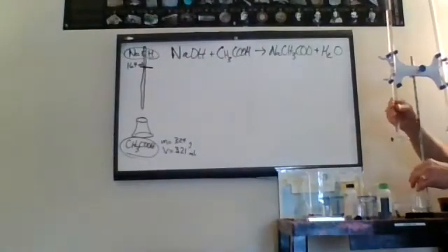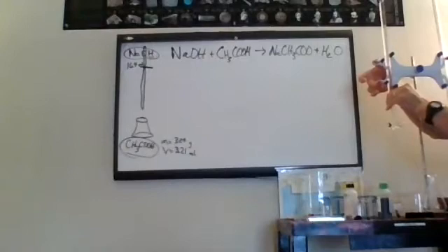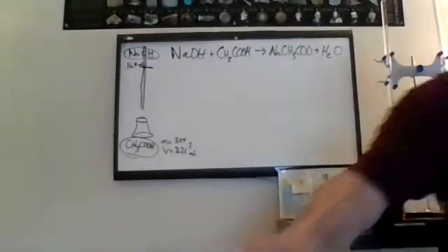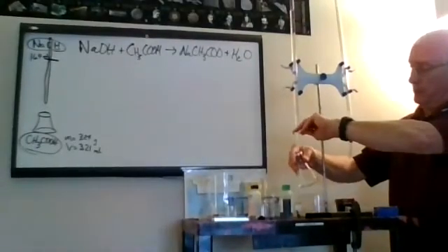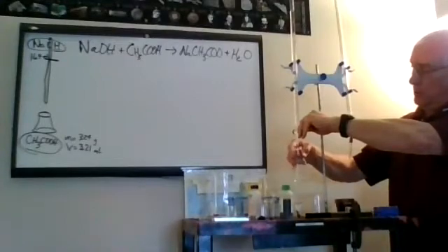So how do I like to do it? Now you do know that you can go ahead and squeeze this and raise it up and down. I'm going to twist there. Let's go ahead and get that a little over here so you can see it better. And then we're going to go ahead and twist and shove. Here we go. This will not take long. Before it flashes. So I'm going to go easy, easy.